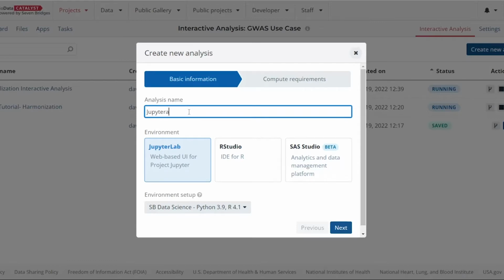And then you fill out your compute requirements. So here's where, as Tony mentioned, you can scale up. You can choose a very large single node or a very small one, depending on what you want to do. It'll give you an estimate of how much per hour it will cost against your cloud credits. And it sort of goes up from there.